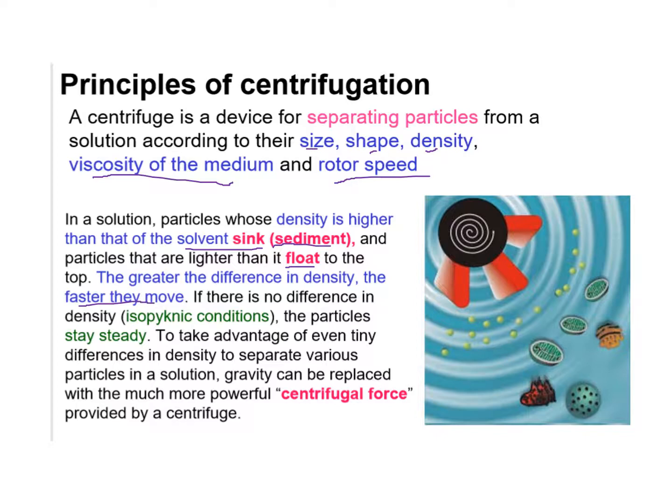If there's no difference, that's called isopycnic, and that is a whole type of centrifugation. It's a flavor called isopycnic centrifugation. If there's no difference, then everything has reached its equilibrium and they stay steady or stay in equilibrium. So iso means the same.